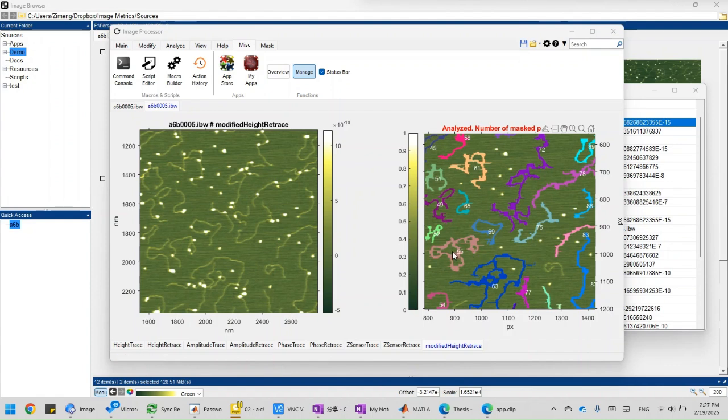All we need is to make sure they're connected instead of disconnected, right? They're connected in one piece, and then we can do individual analysis on them. That's the most important, right? We don't have to separate them at this point. We're not doing bulk analysis. We're doing single molecule analysis eventually.